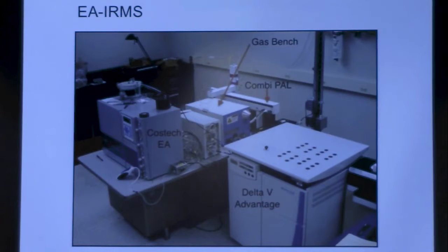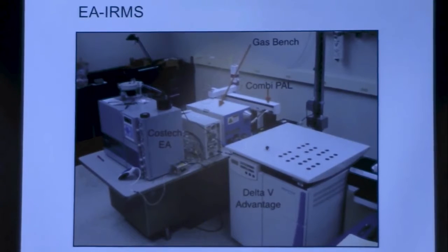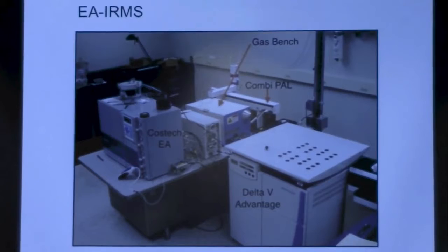The instrument is here on the lower right, and then the various inlet systems, there's three of them there on that particular system. You can switch back and forth between these things. So there's incredible versatility to the instrumentation, all again tied to continuous flow inlet systems.